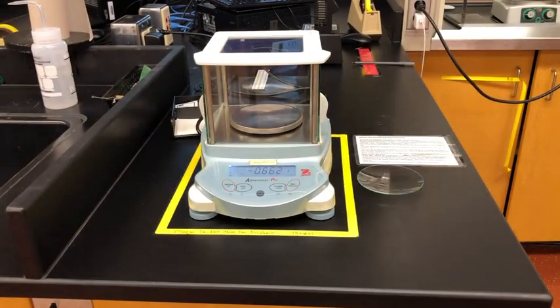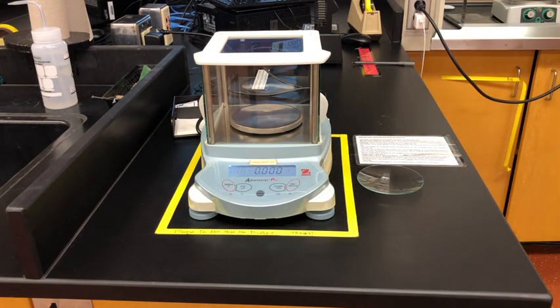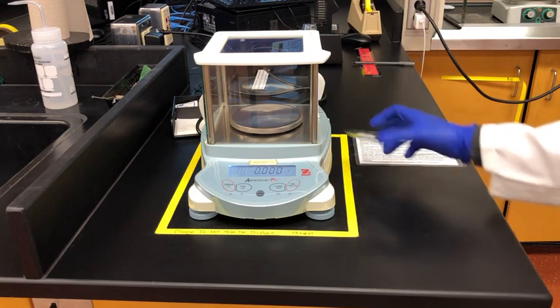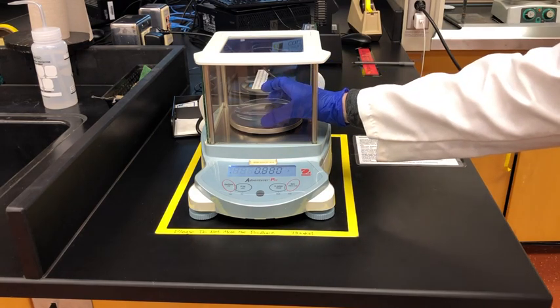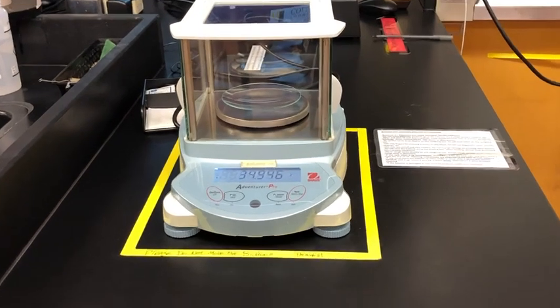While we're waiting for the sample to boil we're going to zero the balance and then weigh our watch glass. This watch glass is what we'll use to place our sample on so we can get an accurate mass later on. We'll take note of the mass and I'll also include it in a data document on Canvas.